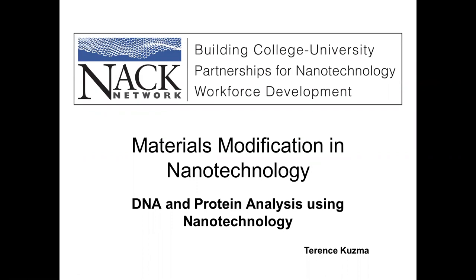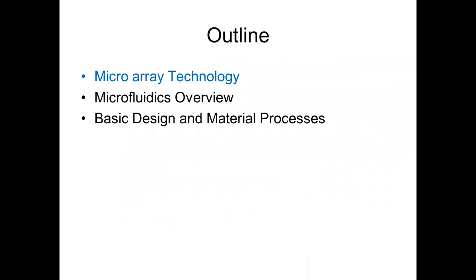What we'd like to do today is take a look at material modification and nanotechnology. Specifically, when I look at DNA and protein analysis and how we would use nanotechnology to solve those problems or look at those materials. So what we're going to do basically is take a look at microarray technology and how microarrays are used.